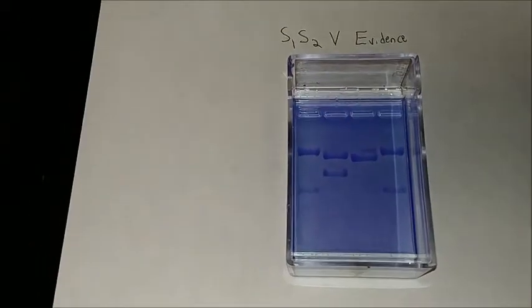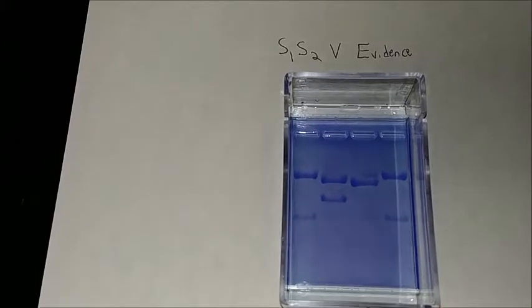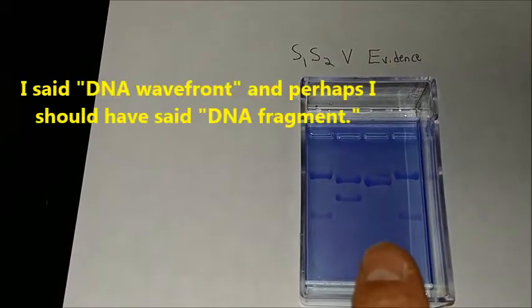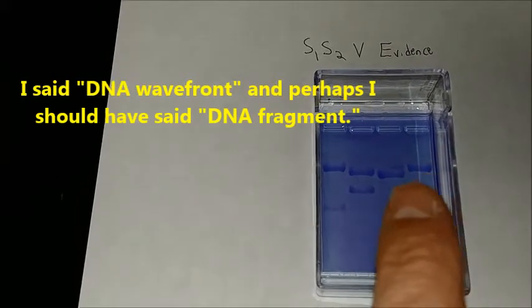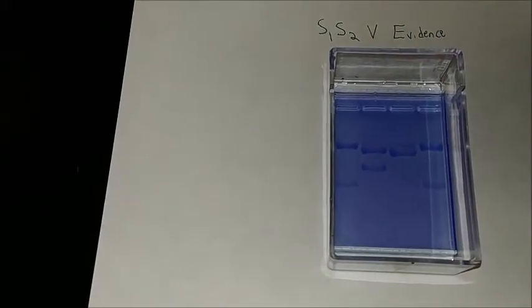After an overnight de-stain wash, look at the clarity that I have now. Is this not beautiful? Pretty clear that suspect one and the evidence agree. There is a little DNA wave front kind of showing up in the victim category, but I think that was some spillover from the DNA that I had put into the evidence well earlier. Very nice result.